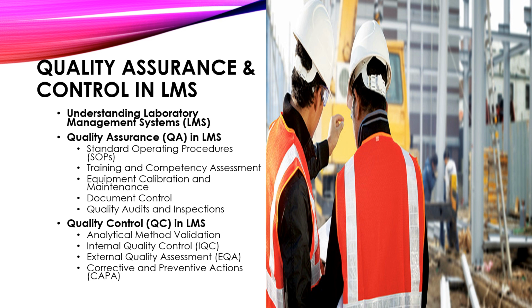Equipment calibration and maintenance. Regular calibration and maintenance of lab equipment or instruments to uphold accuracy and reliability in test results is key and cannot be overemphasized.